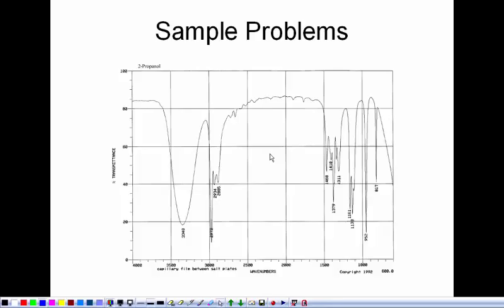So what I do is I read the spectrum from left to right. I'll look for OHs, I'll look above 3000 for alkenes and aromatic systems. I'll look below 3000, but I'm not surprised if there's peaks there because it's an alkane. And then I'll look for carbonyls. I'll just take an inventory of what functional groups are there. And this molecule is 2-propanol, that's isopropanol. So it's CH3, CH, OH, and then CH3.